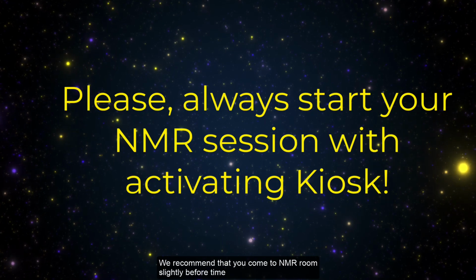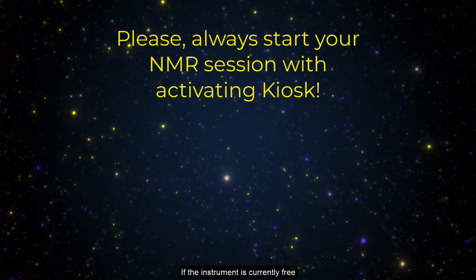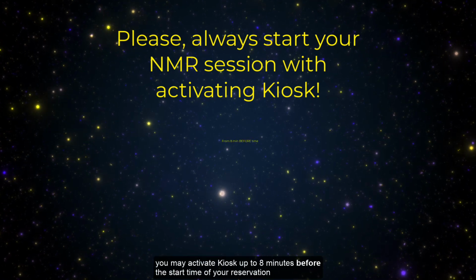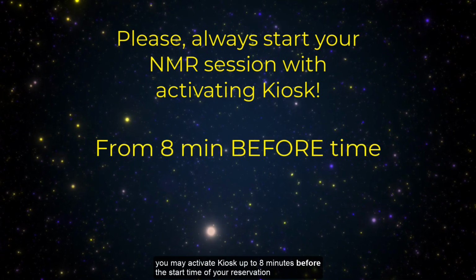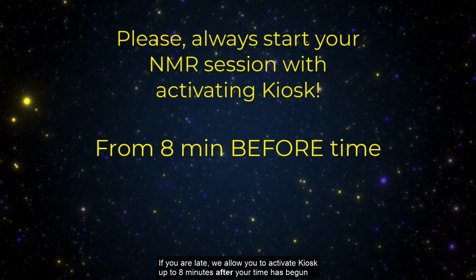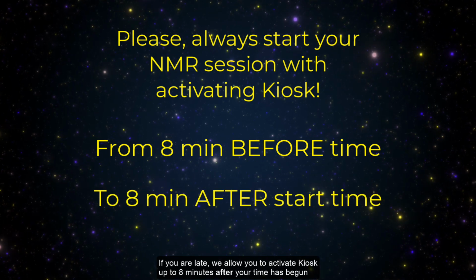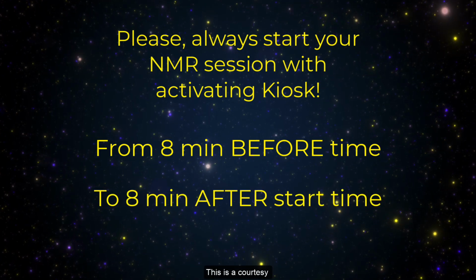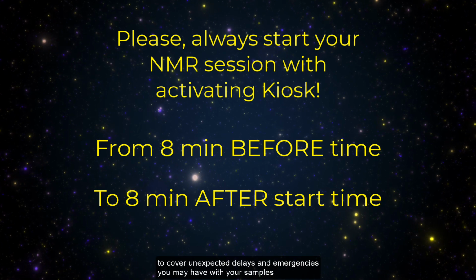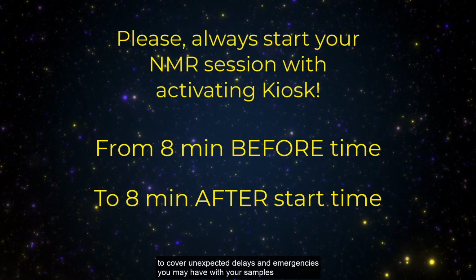We recommend that you come to the NMR room slightly before time. If the instrument is currently free, you may activate the kiosk up to 8 minutes before the start of your reservation and begin using your instrument. If you are late, we allow you to activate the kiosk up to 8 minutes after your time has begun. This is a courtesy to cover unexpected delays and emergencies you may have with your samples.